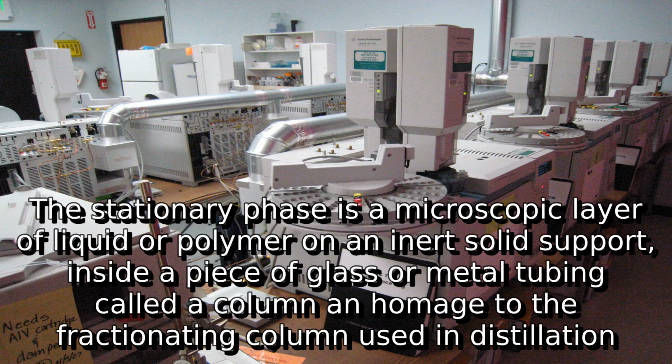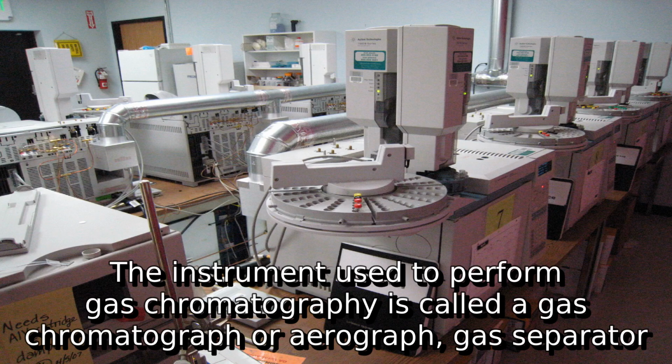The stationary phase is a microscopic layer of liquid or polymer on an inert solid support inside a piece of glass or metal tubing called a column, an homage to the fractionating column used in distillation. The instrument used to perform gas chromatography is called a gas chromatograph or aerograph.